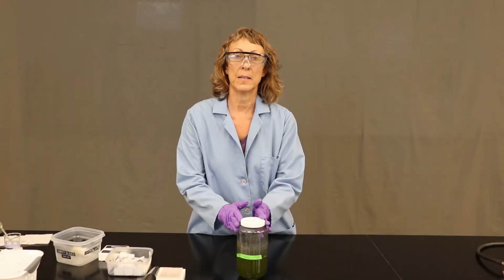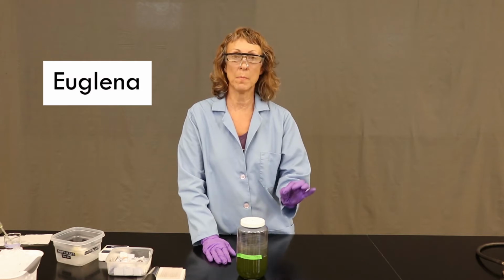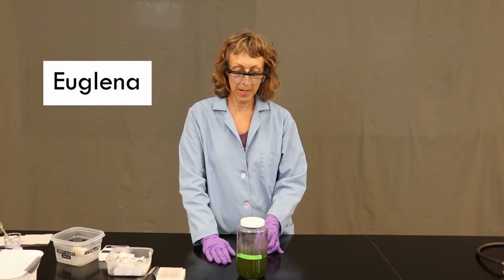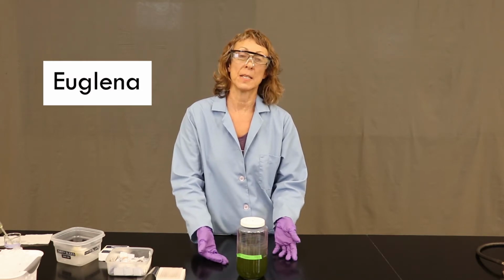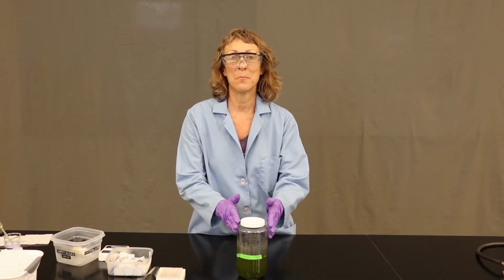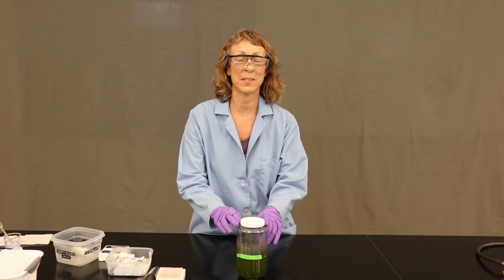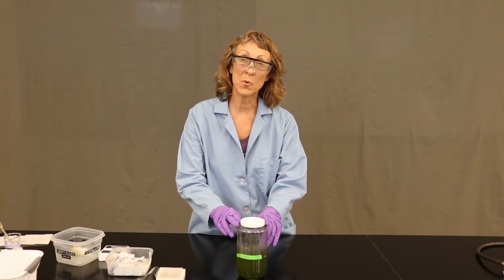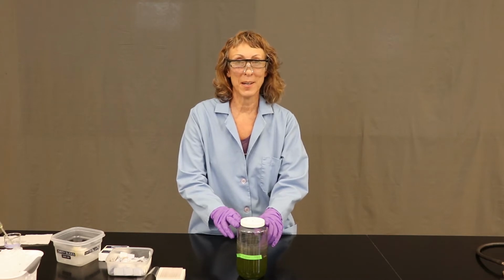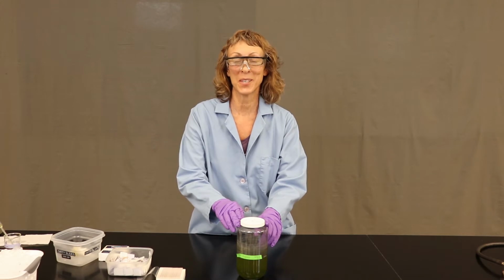Our next slide is going to be of Euglena, which is a small microscopic organism that's in the Protistan kingdom. It's a little fun because when you look at it under the microscope, it's green because it has chloroplasts, and it moves around, which is not something that you normally associate with photosynthetic organisms.